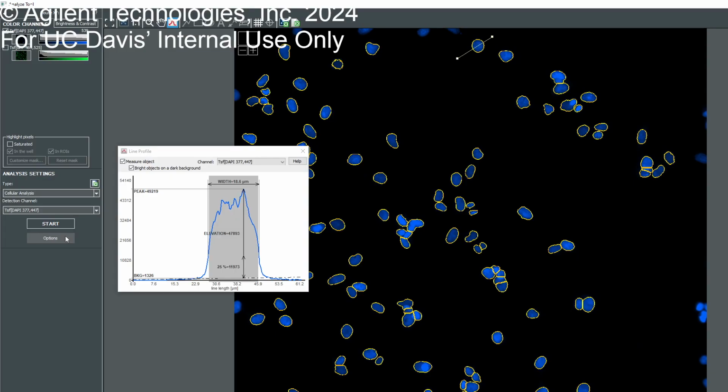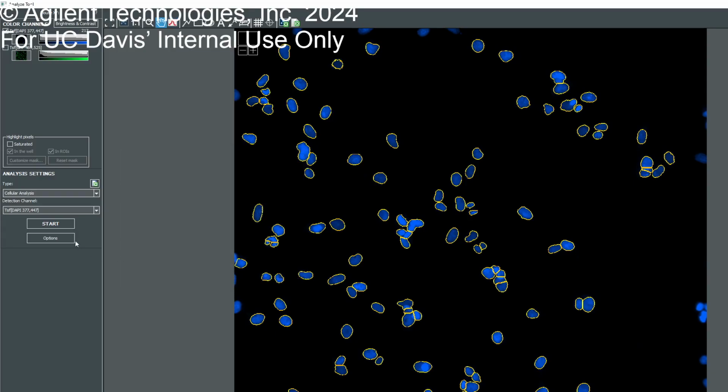Please explain again what the 25% indicates. Yeah, so this is the background noise of this image, right? If you look at the signal intensity here, I'm sorry, I'm touching your screen, that's 1300. Most likely this cell has an intensity of 49,000. So the software is automatically determining what is going to be an ideal threshold for you to use. That's in between these numbers, and that's that value. So you just use that for the determination. And if you do the math, it's going to be close to 25% of this difference. So far so good.